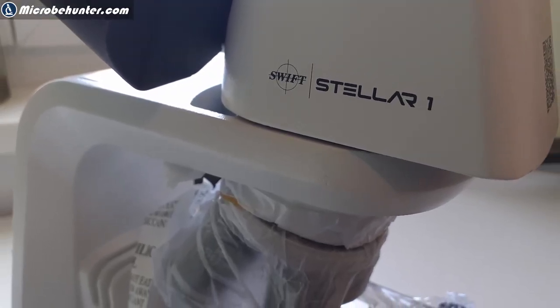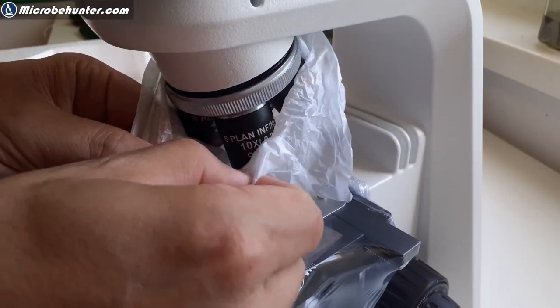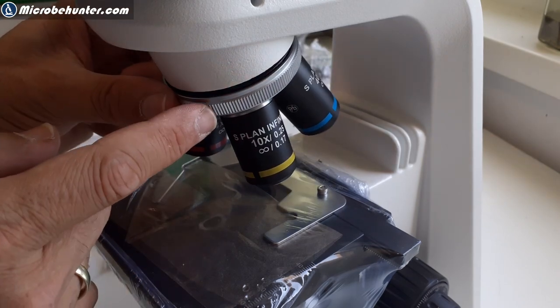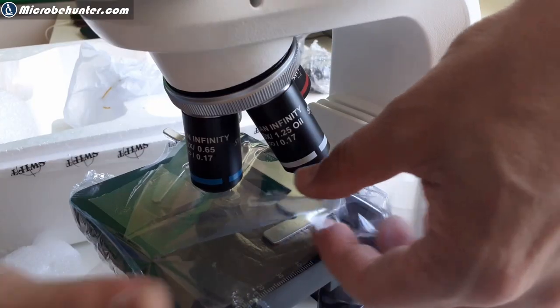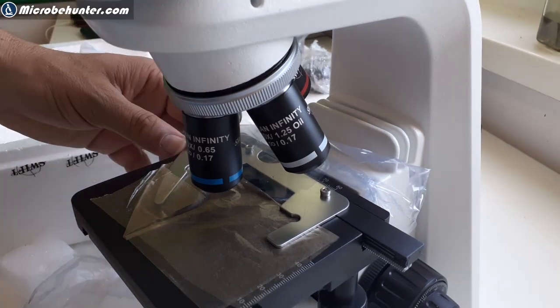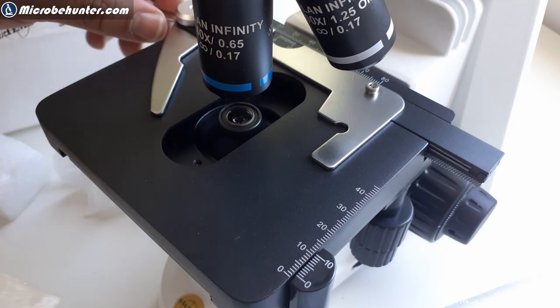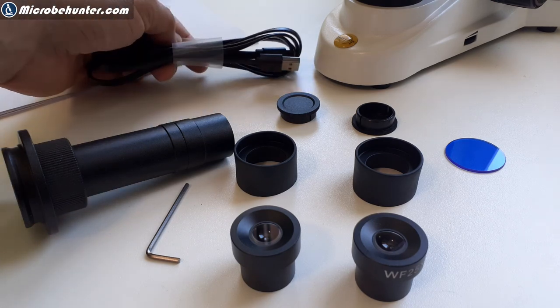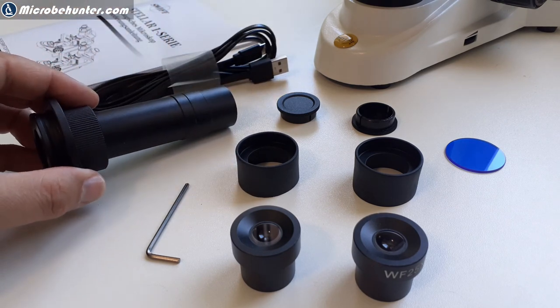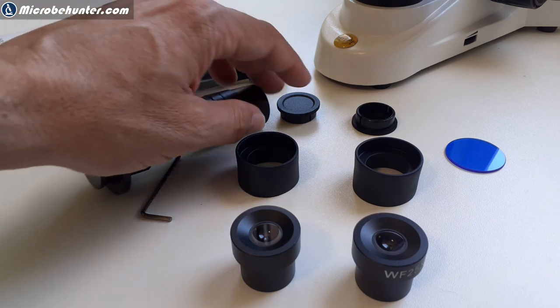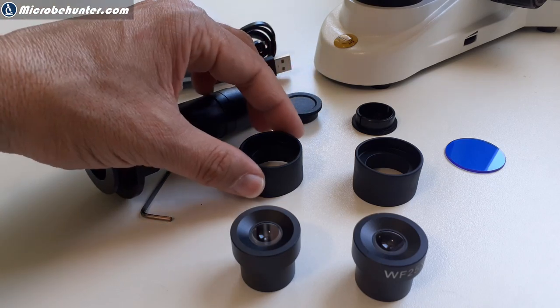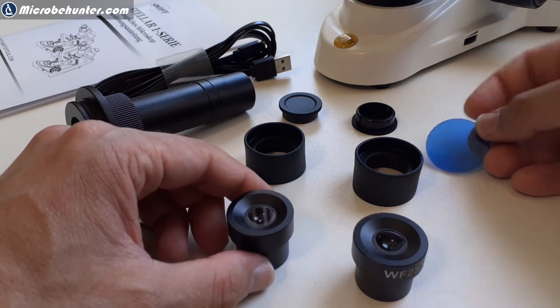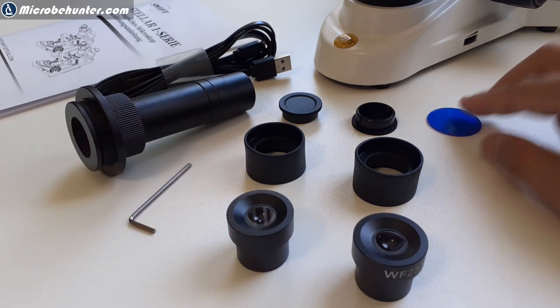And this is how the microscope looks like everything was also packaged individually to protect it from dust. And after I've taken it out, I could also see that there was quite a bit of heat shrink plastic wrap around it to make sure that the parts all stay together during transport. That's the name of the microscope. It's called the stellar one. And here we now see the objectives and the version that they gave me was the infinity version. And it's important that you understand that the infinity version and the conventional DIN version are not compatible with each other. So you cannot exchange objectives. This is now the stage. There's also a little bit of paper here to protect it from scratches and from dust. And this is what you get.